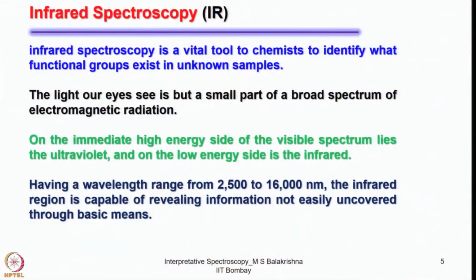Now let's move on to IR spectroscopy. I am sure you are all familiar with infrared spectroscopy. Infrared spectroscopy is a very important tool for chemists to identify what functional groups exist in unknown samples or samples we have made in the laboratory.